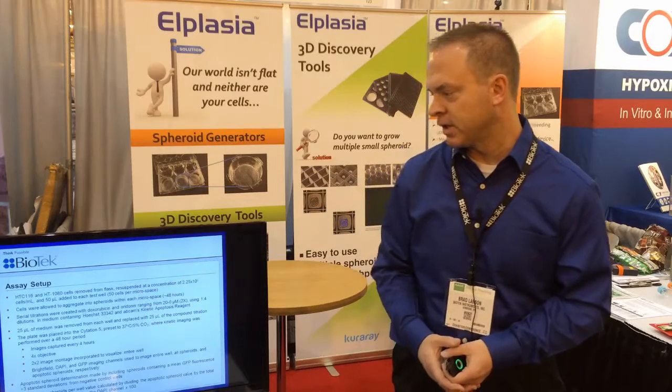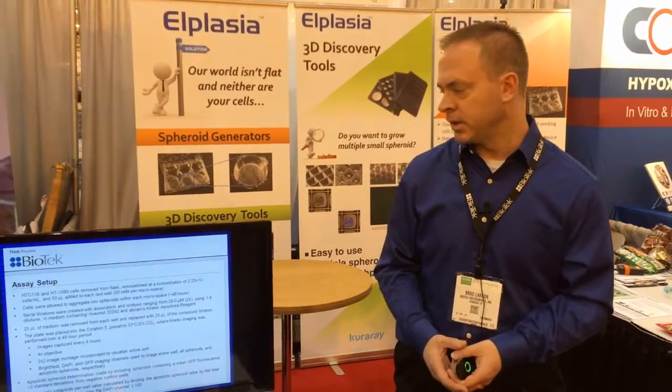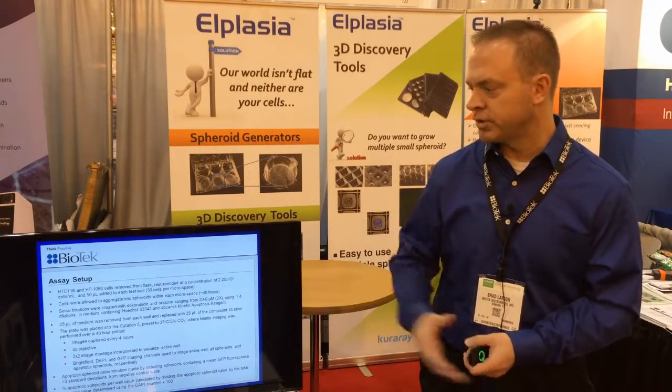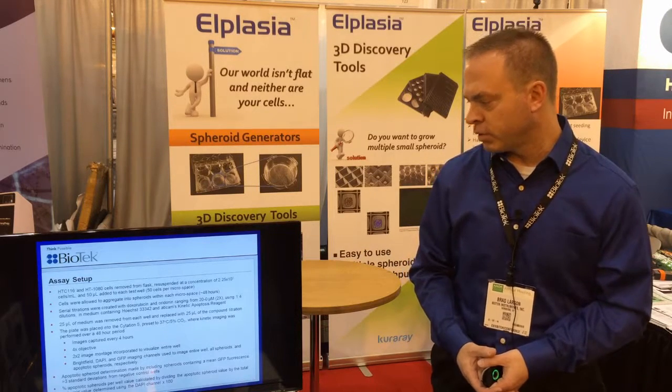With that concentration, dividing it out amongst all the pores gives approximately 50 cells going into each micropore space. The plates were then put into our tissue culture incubator for approximately two days, which allowed the cells to aggregate into nice spheroids. I'll show you some images we captured of those spheroids that formed over time.